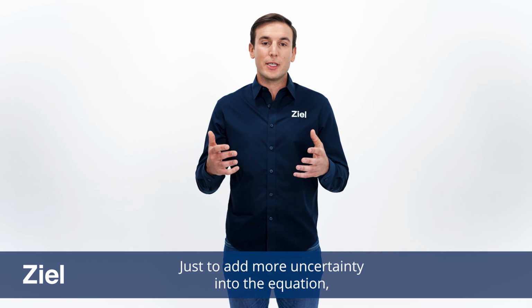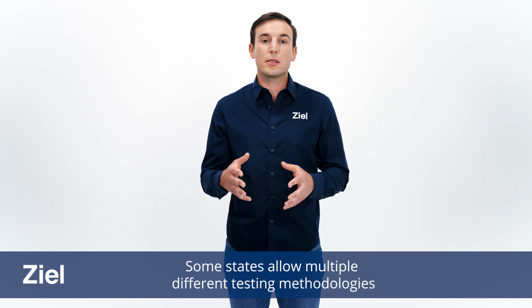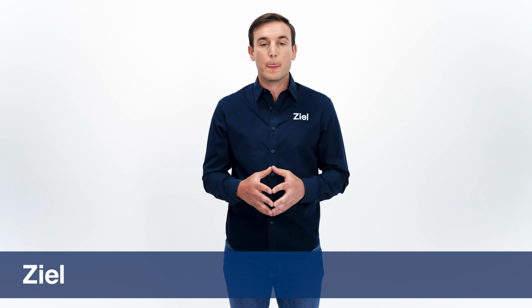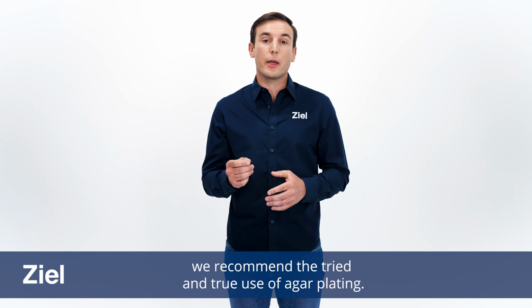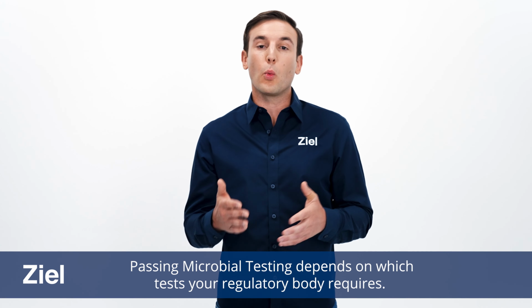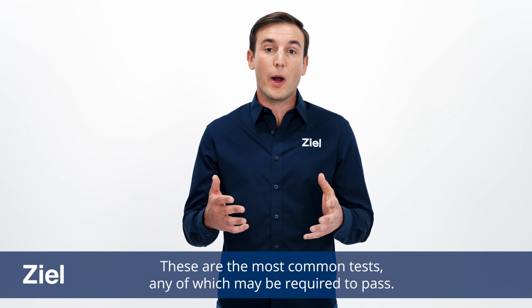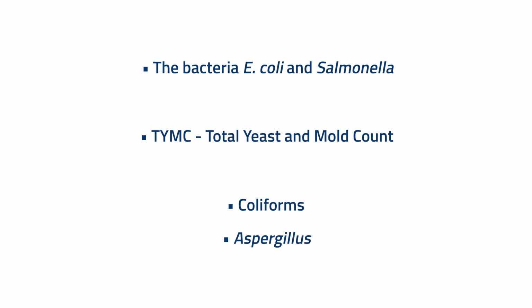Just to add more uncertainty into the equation, testing in the cannabis industry suffers from a lack of standardization. Some states allow multiple different testing methodologies, and nearly every state has different rules from one another. If you have a choice in how your product is tested, we recommend the tried and true use of agar plating. Passing microbial testing depends on which test your regulatory body requires. These are the most common tests, any of which may be required to pass. The bacteria E. coli and Salmonella, bile-tolerant gram-negative bacteria, TYMC, or total yeast and mold count, TAMC, or total aerobic microbial count, coliforms, and Aspergillus.